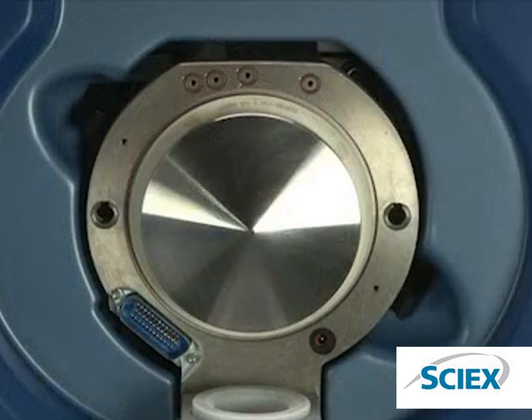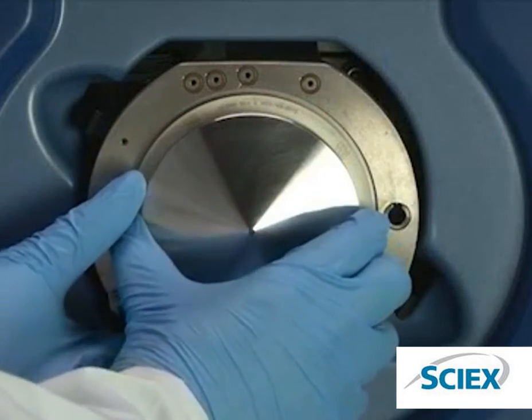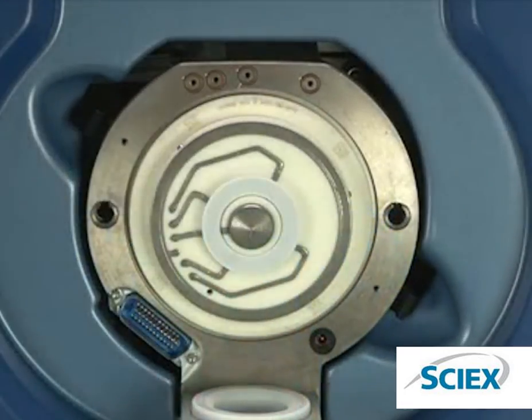Before removing the curtain plate from the instrument, make sure that the interface is at room temperature. With two hands, pull the curtain plate back from the body of the mass spectrometer. Never use tools to remove the curtain plate as this will break the ceramic orifice plate.